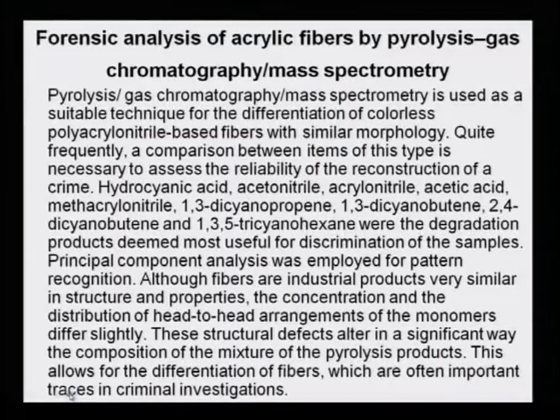So, you see the versatility of the GCMS machine, be it clay, be it forensic samples, be it wine samples, be it terpenoid analysis. Various modifications and various adaptations help us to use this particular universal machine for different types of samples and give us very sensitive and very accurate results to be able to interpret the required information. So, with this we have come to an end of a very important detection machine, which is called GCMS.